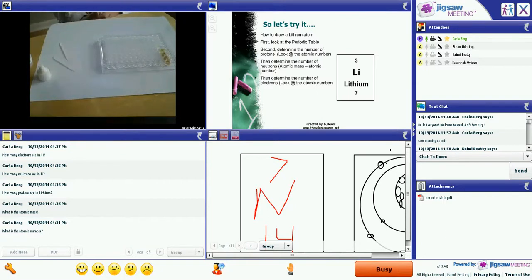Okay, now I have a reaction taking place in my well plates. It asks you in step 3 to mix the solution in wells A1 through E1 using your plastic toothpick, being sure to rinse the toothpick between times with distilled water. Now, Ethan, if you do not have distilled water, rinse it in regular water and then dry it off.